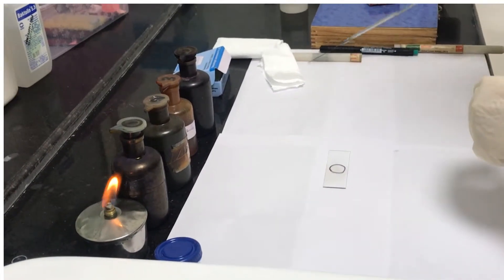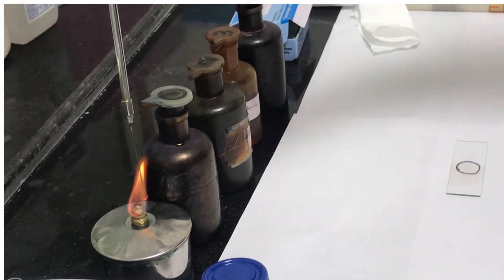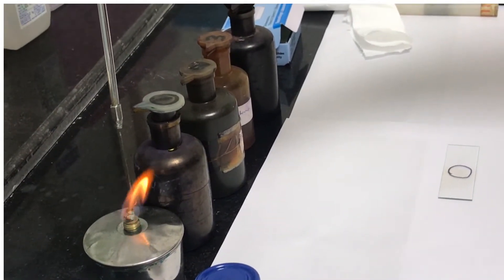Take the inoculating loop and sterilize it by making it red hot in the Bunsen flame and let it cool.